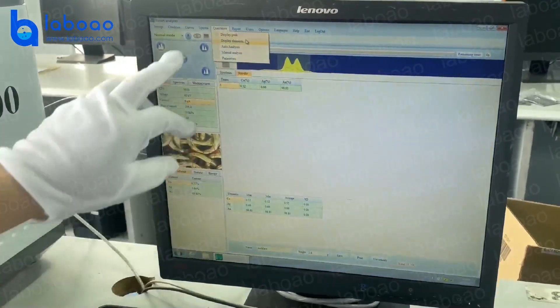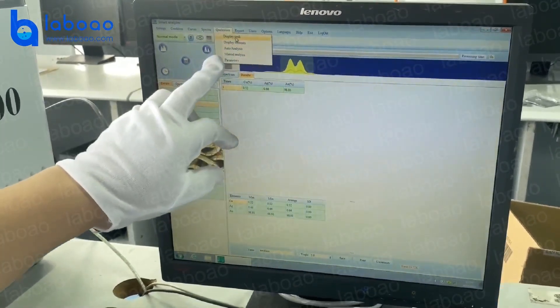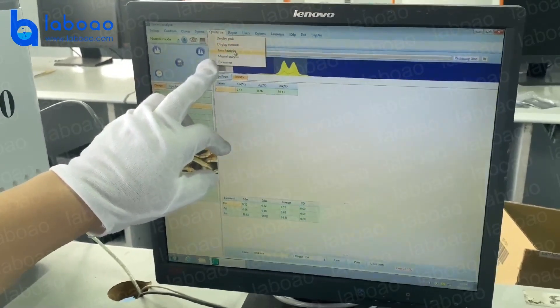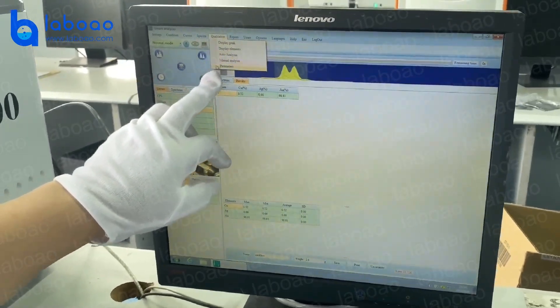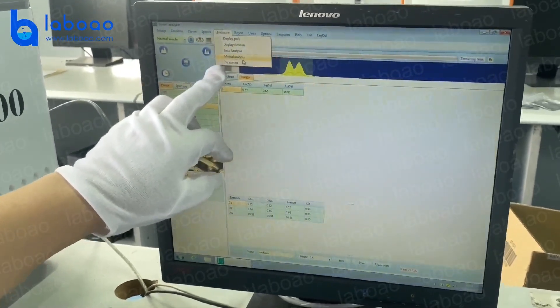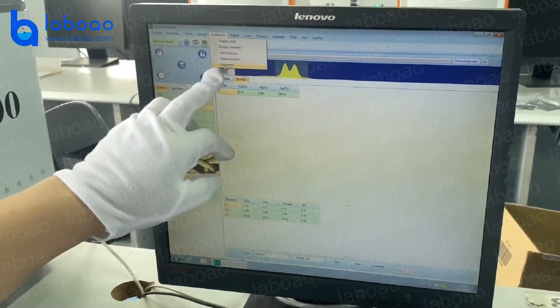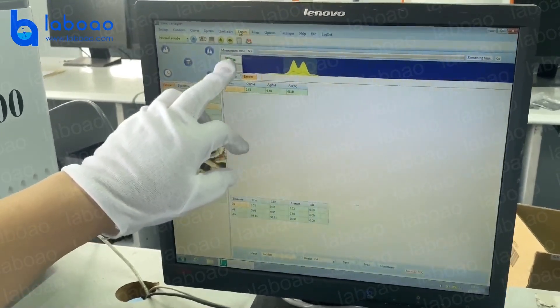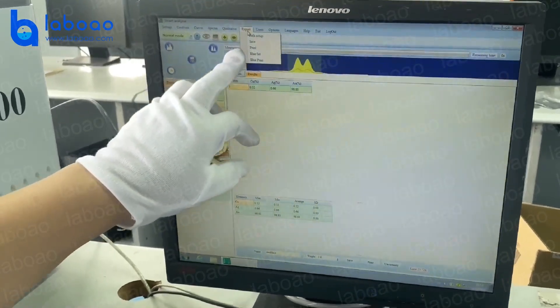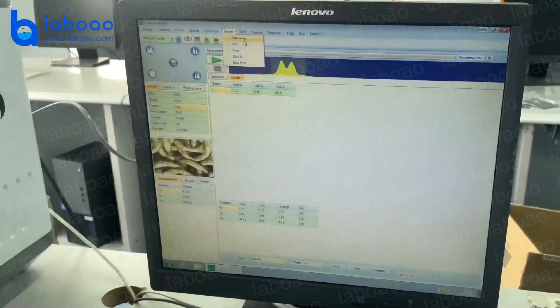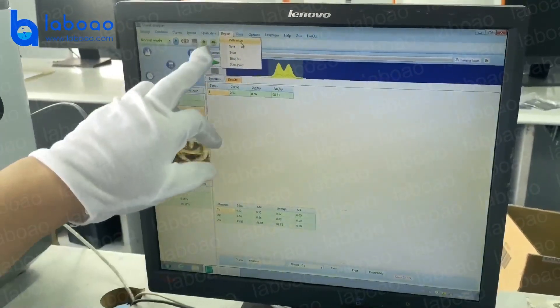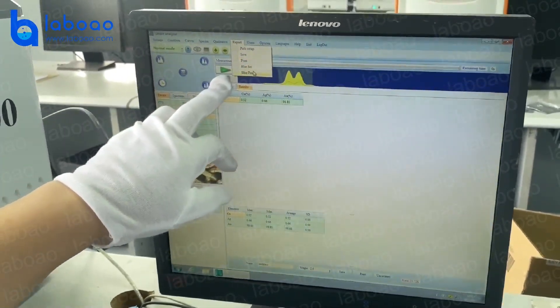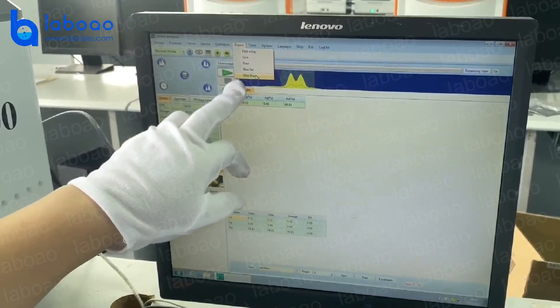This section is for engineers to see the peaks and identify elements. There is also an auto analysis menu and a parameters settings section. Under test report, we can save the report to a path, print it, or also use Bluetooth to print.